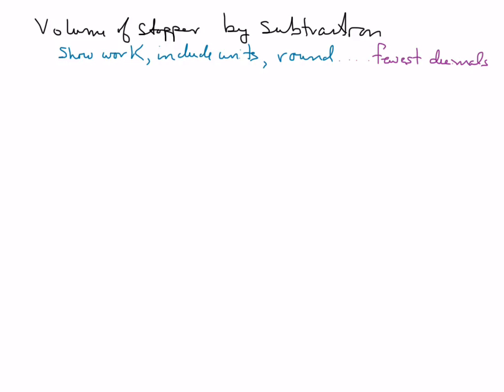So it's the Crisco method. Basically, what you're going to do is use your 50 mL graduated cylinder, which will probably work best. You're going to fill it up to about 25 milliliters. It doesn't have to be exact, but you do need a fix on what that volume is.